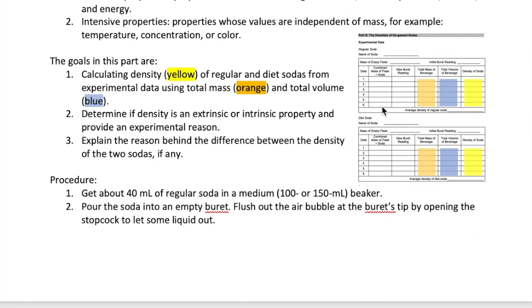Once you have 6 data points, which is about 30 milliliters of soda, you can continue to the next table, which is doing the same steps but using diet soda as the substance.